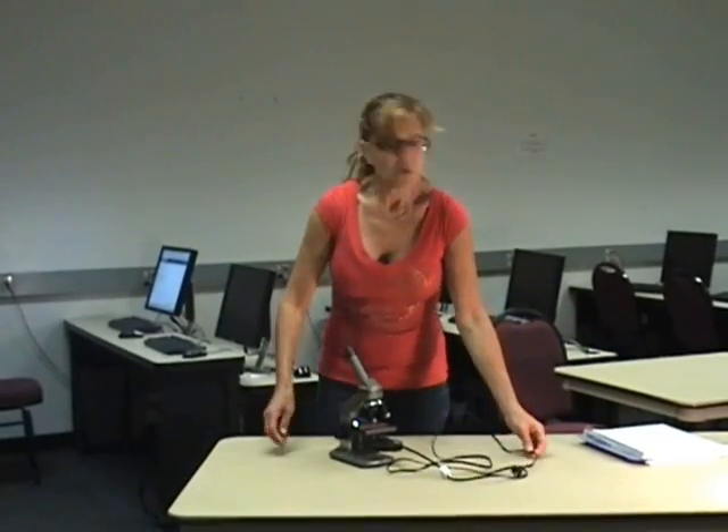Never let the cord drag over the table. Most stations for microscopes have an outlet on the table for the cord — that prevents the cord from dangling so that someone might trip on it. Always keep a dust cover on your microscope when it's not in use.